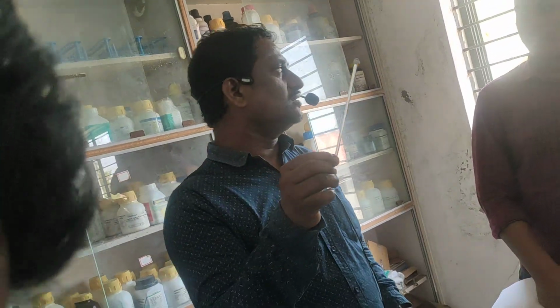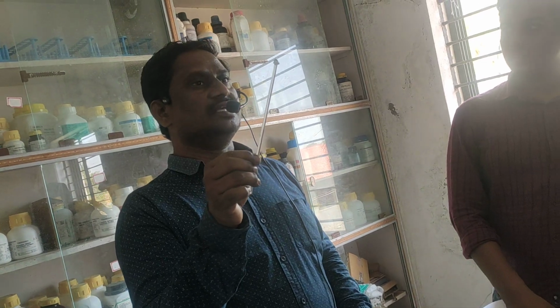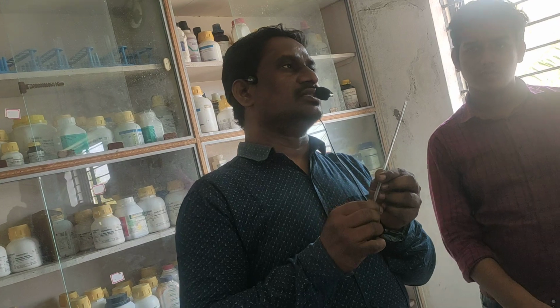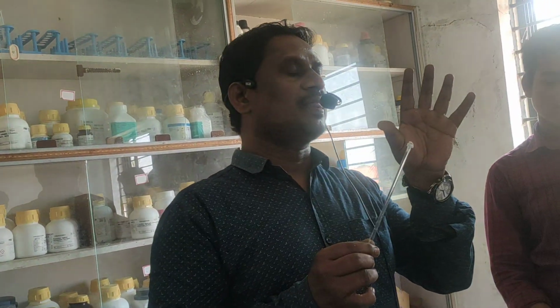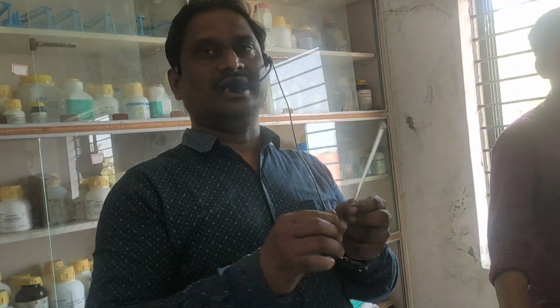Next, the given salt is CaCO3. So like this you have to perform CaCO3 salt analysis. This is an inorganic salt. We are identifying the cation and the anion.